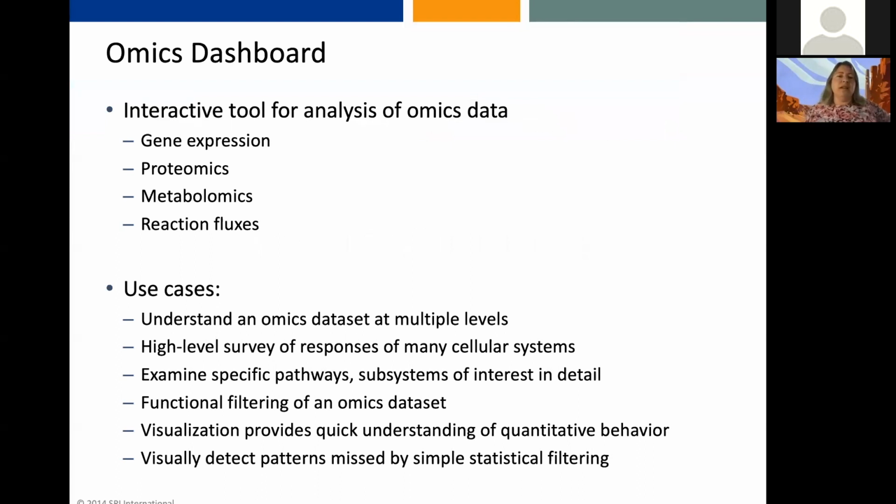This is an interactive tool for analysis of omics data. It's a web-based tool. It's most useful for gene expression and proteomics data. It can also be used for metabolomics or reaction flux data.